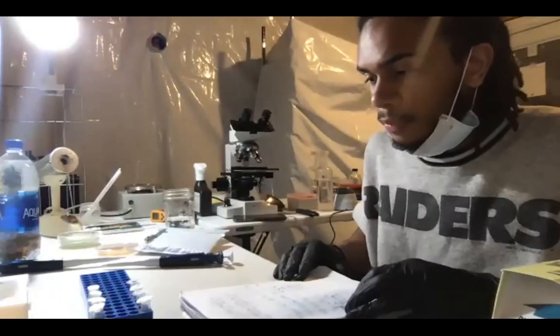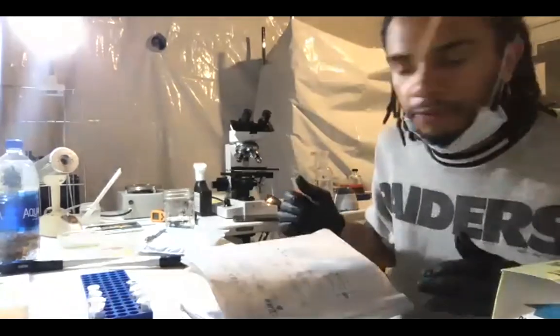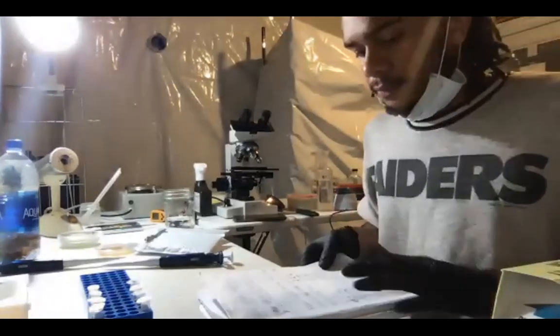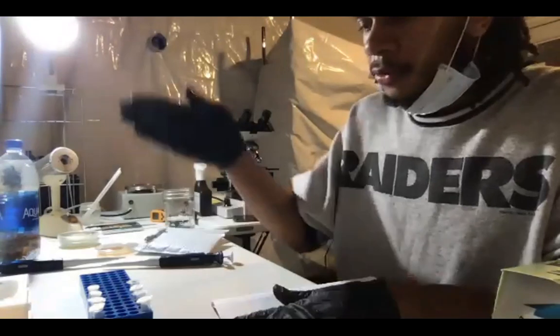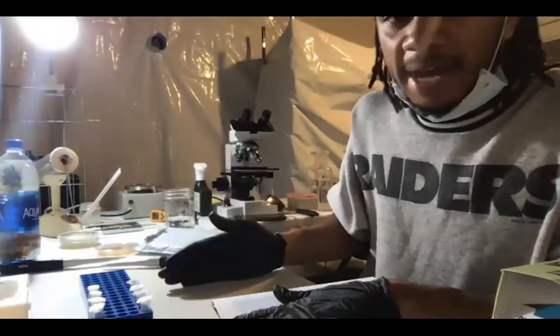That's what you need in total, but because we're going to do 4 of each, you just cut that in half. So I should have just gone with 4 like I was saying at the beginning. I hope I didn't confuse anybody. So in total, we're doing 8 reactions, but we're doing 4 with the MAT1 primers, and 4 with MAT2 primers.